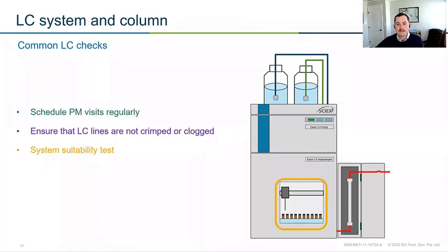So you can say, hey, over the past month, I've lost a quarter of my sensitivity, et cetera. This could be just the analysis or the assay you're doing. Or in our case, here at SCIEX, we just use a pharmaceutical mix that's very simple and stable. We inject that periodically, about once a month, and just keep an eye on our instrument, so if we do notice drops in sensitivity, we can plan for some downtime.